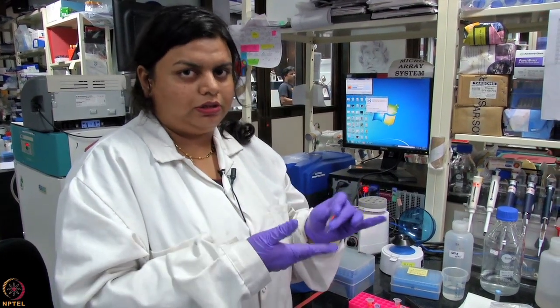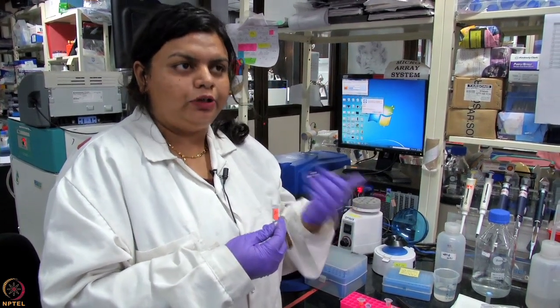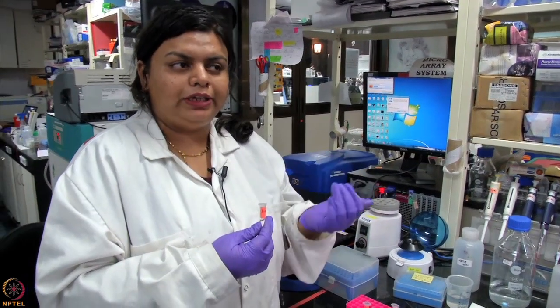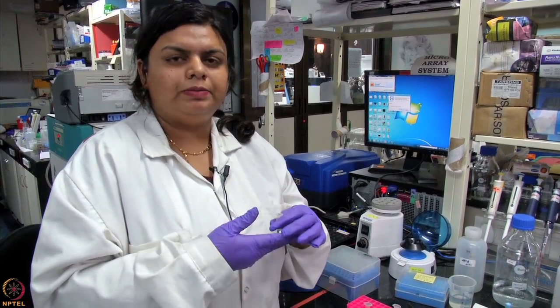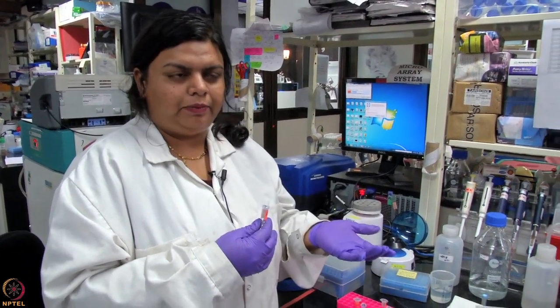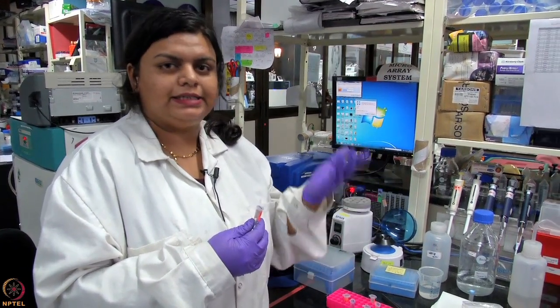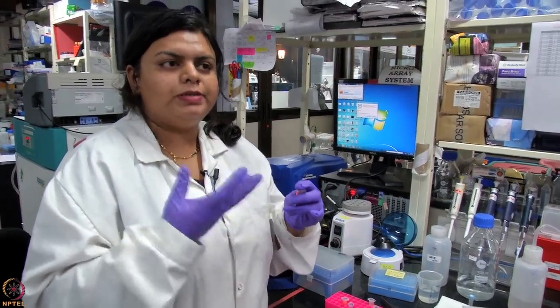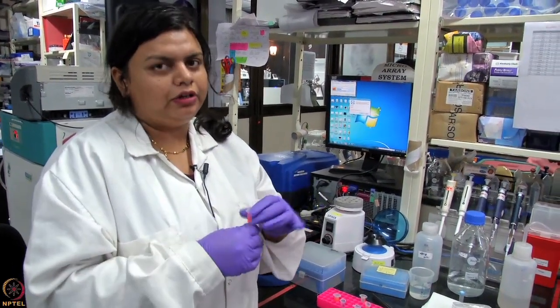You can use monoclonal antibody as well as polyclonal antibody. For example, if you're trying to pull down a protein which has many family members, for example annexin, there are many annexin proteins present in human or mammalian tissues, annexin A1, A6, A2. No matter how specific your antibody is, all the members of this protein family will definitely cross-react.